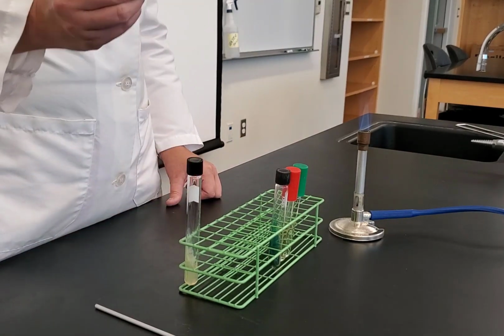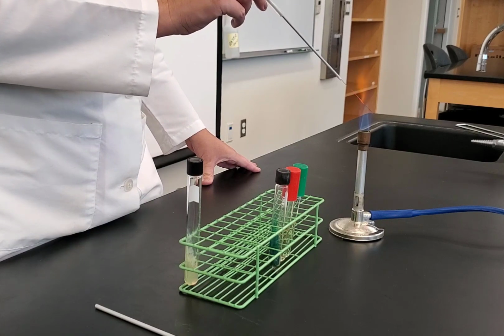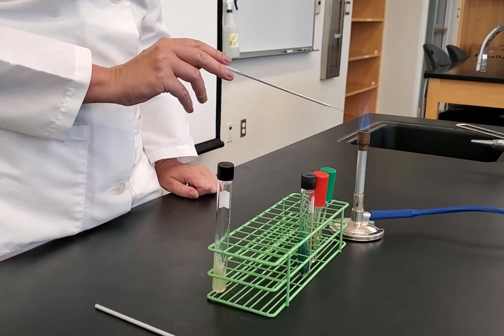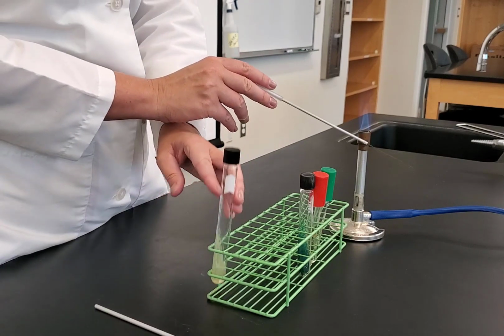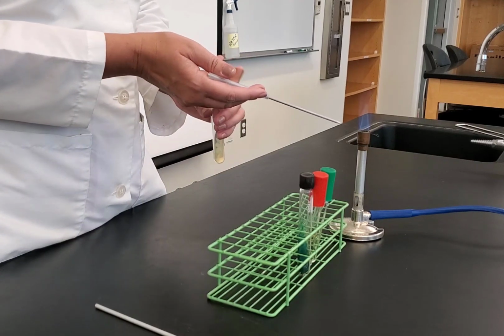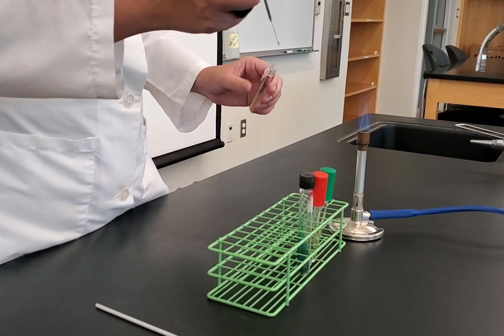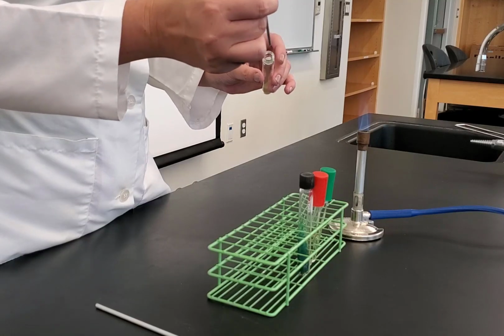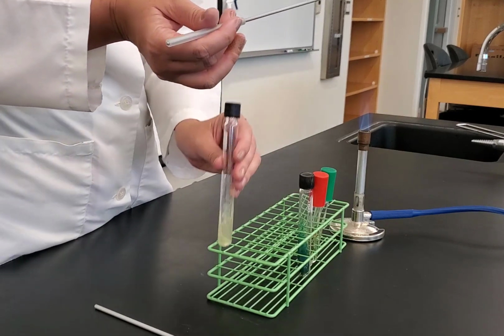So I'm going to start with my loop, and I'm going to flame sterilize. And I'm going to let it cool. Again, I have my E. coli here. So palm side up, pinky ring finger, flame it, and I'm going to go in, and I'm just going to pick up some of the bacteria. Come out, flame sterilize, set that down for a minute.